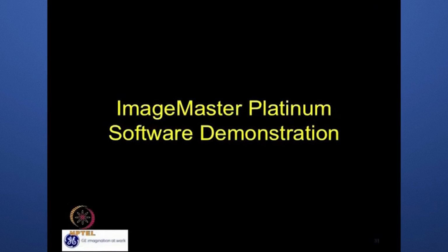Image Master Platinum software demonstration. Shall we start? Sure. I guess you gave an overview of the whole data analysis one can perform using the software, and the different types of challenges one may face during the analysis, as well as the different parameters one can use for proper image processing. But I think it will be really useful to see the software layout and how one can take these images for analysis. So please go ahead and show the demo on the Image Master Platinum software.